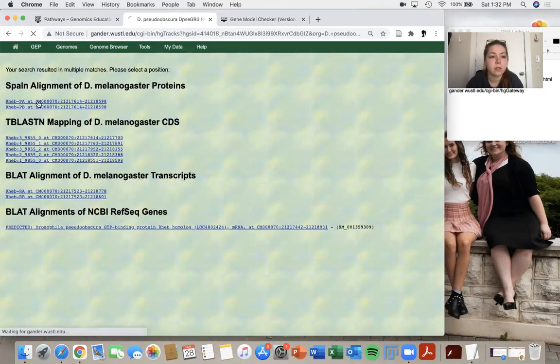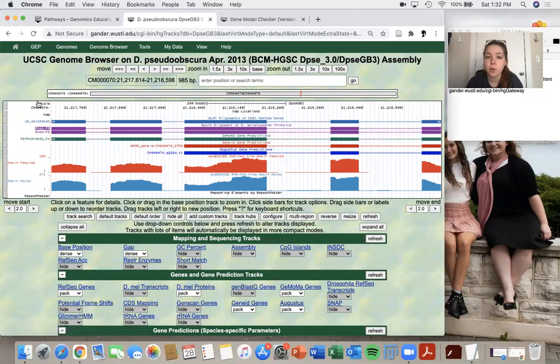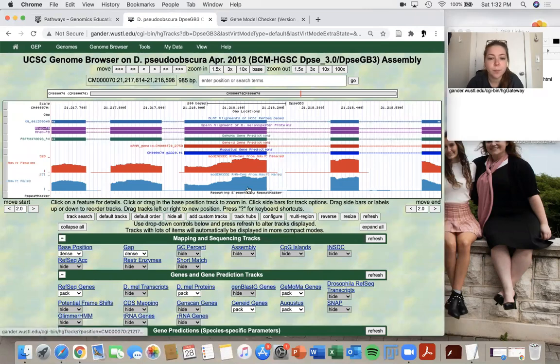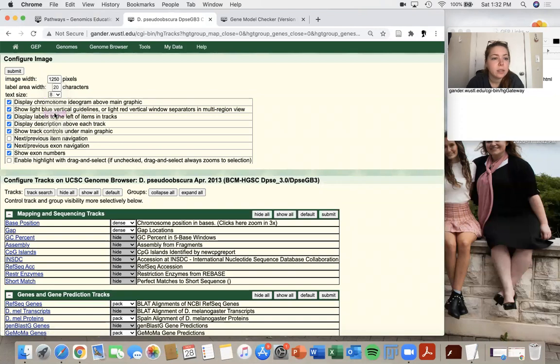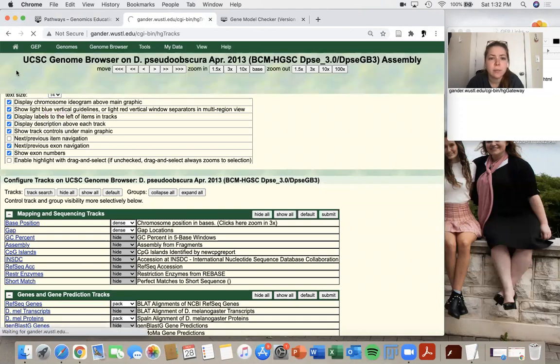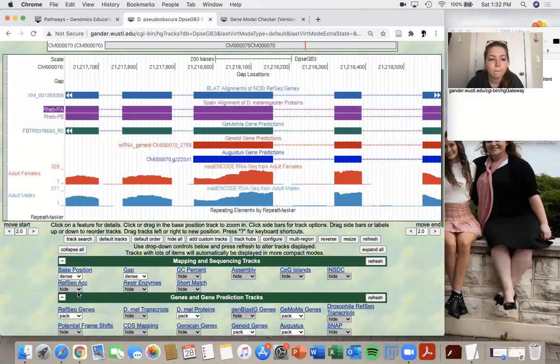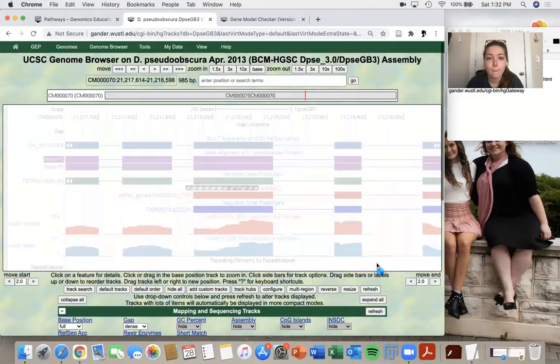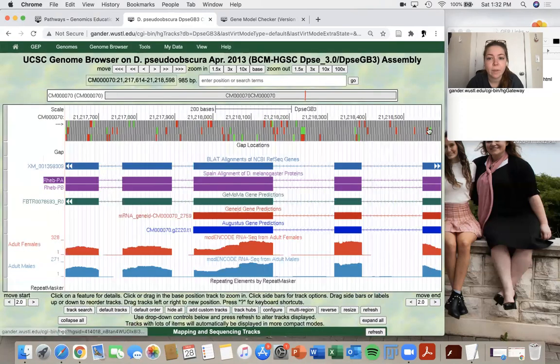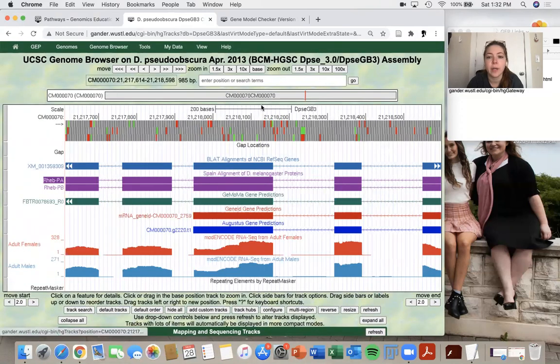I'm just going to choose this top isoform and I'm going to go to configure really quickly. And just make my text size a little bit bigger so that we can all see. I'm going to make my base position full. So now I can see all of my codons and my bases.